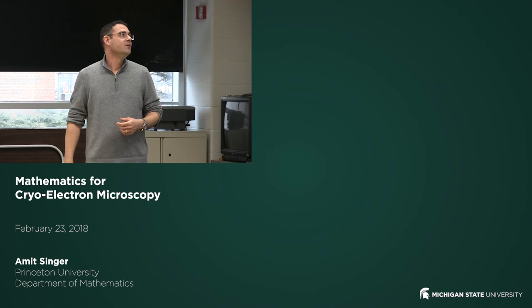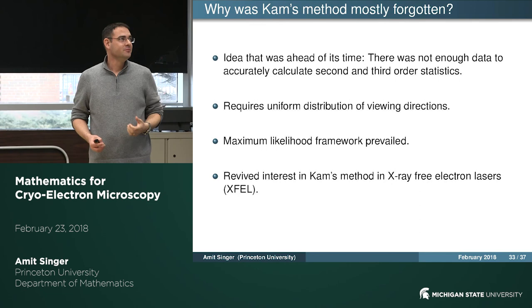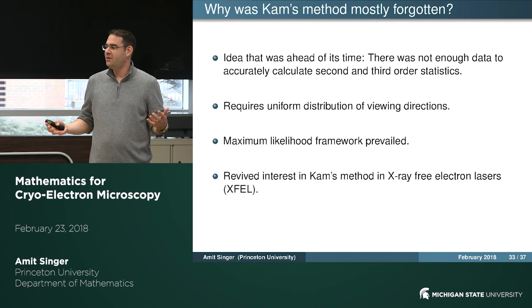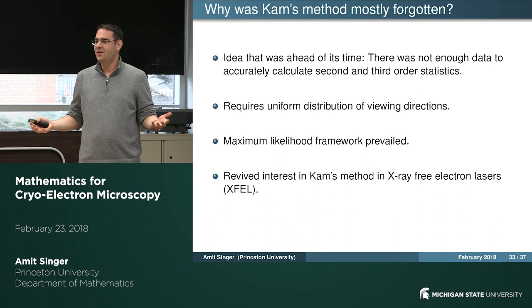So why was Kam's method mostly forgotten? Well, from my perspective, it was an example of an idea that was really ahead of its time. When Kam proposed it in the late 70s, early 80s, they worked with data sets that had dozens of particles, so you can't really compute second order statistics, not to mention third order statistics.